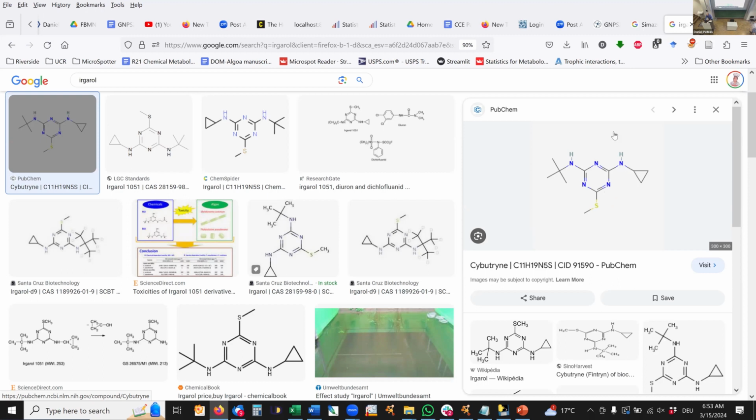And then, oh yeah, I heard it already. What is it? So there's a cyclopropene group, right? And now if you quickly calculate it, it's 3 carbons and 4 hydrogens, right? 5, right? I guess we're getting close to 40. So could that be losing the cyclopropane group, right?